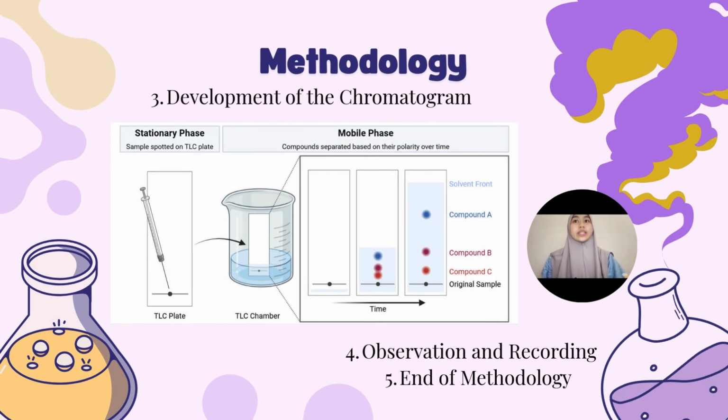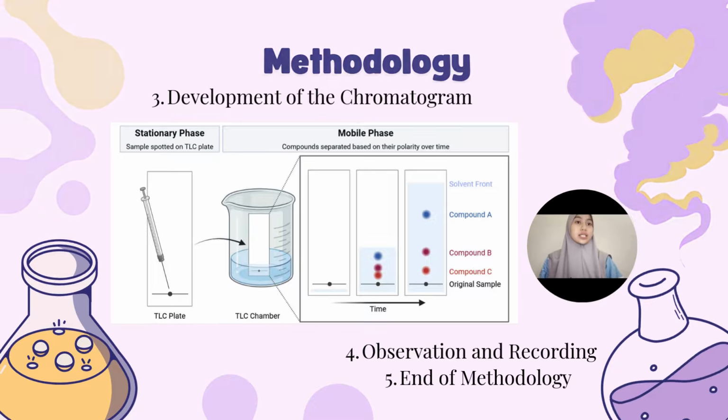Once the solvent had nearly reached the top of the paper, the chromatogram was removed. The solvent front was marked immediately. Different color pigment bands were observed at different heights. The colors and distance traveled by each pigment were recorded for further analysis.